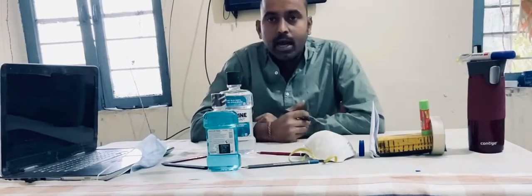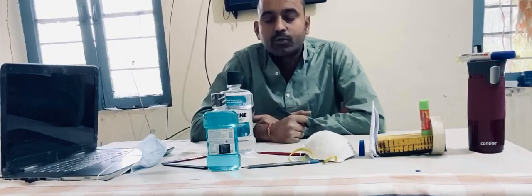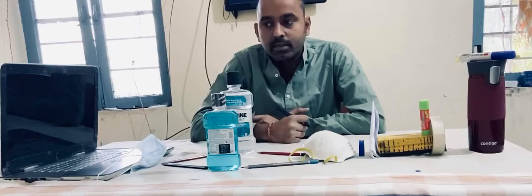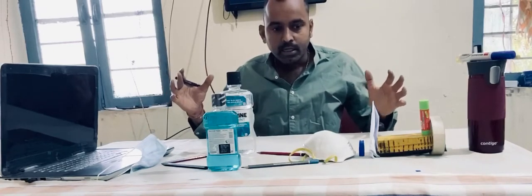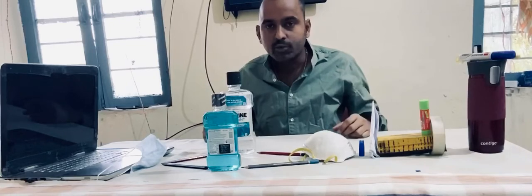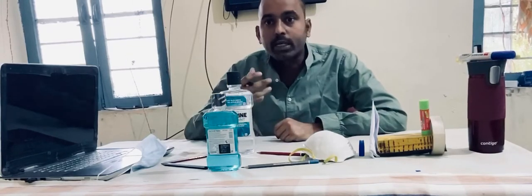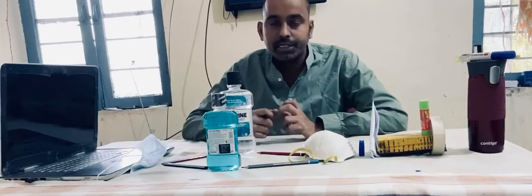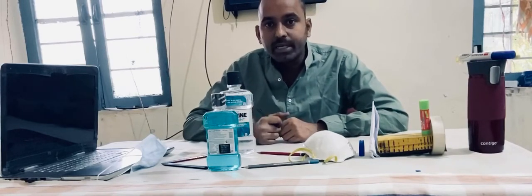Today I am going to teach you the fundamentals of spectroscopy, that is, the instrumentation part. This instrument which I am going to show you a demo of is applicable to all spectroscopic instruments, provided you just remember the basic components of instrumentation in basic spectroscopy. So let us begin my lecture.